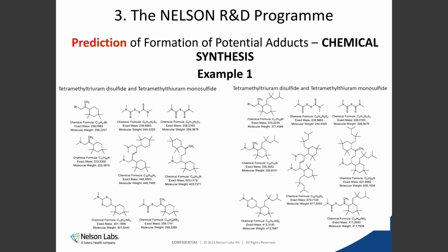This is another example of what can be done. So in the first line there, you can see what we put together. Mixtures of those. On the left side, it's the C13 oligomer. On the right side, it's the C21. We simply mixed it and followed the instruction of the 4 vial strategy that I just explained.